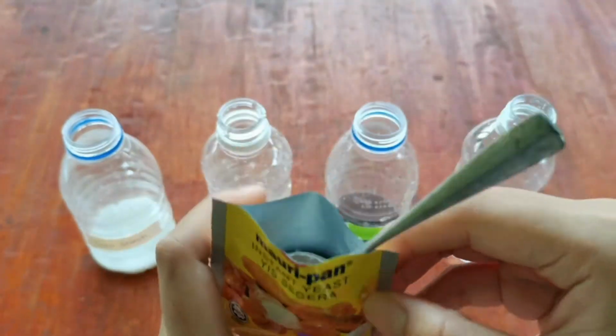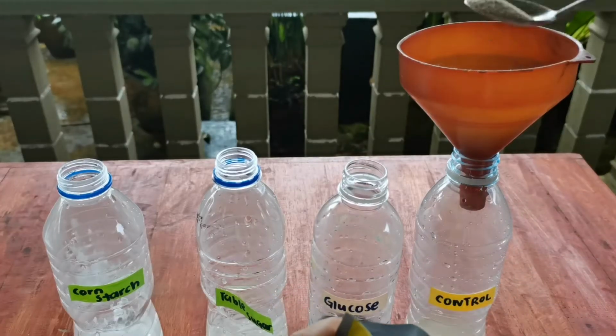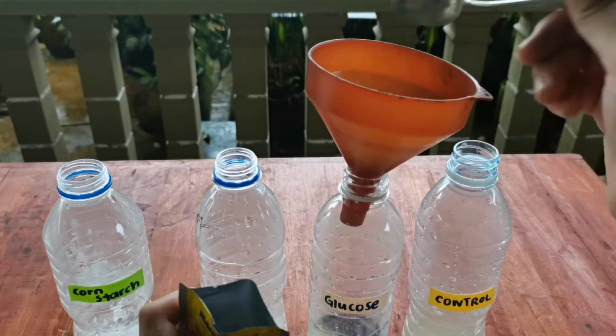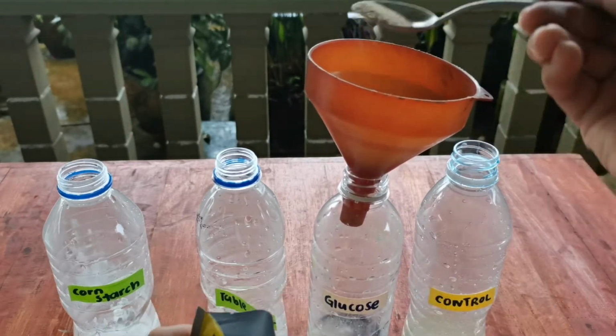Then I'm using Mauripan instant yeast as the source of the yeast. Add 3 spatulas of this dry yeast into each bottle.